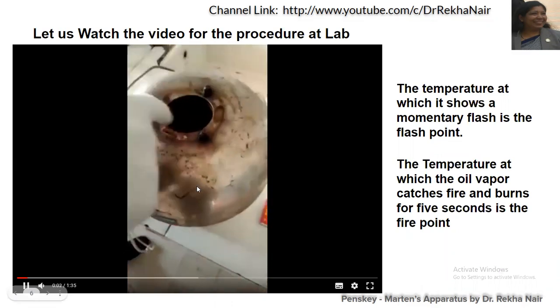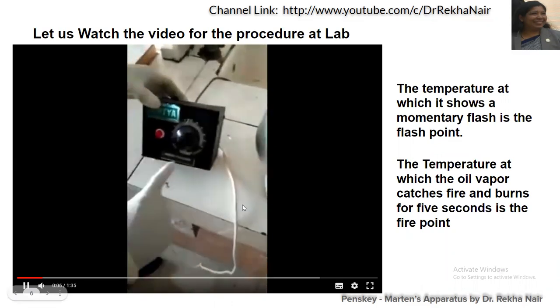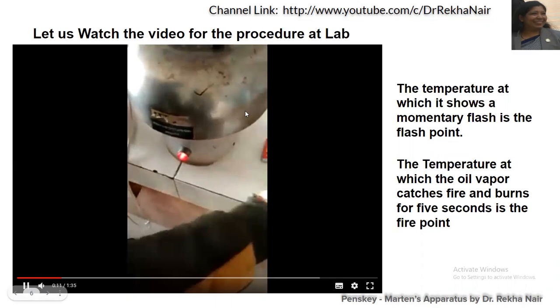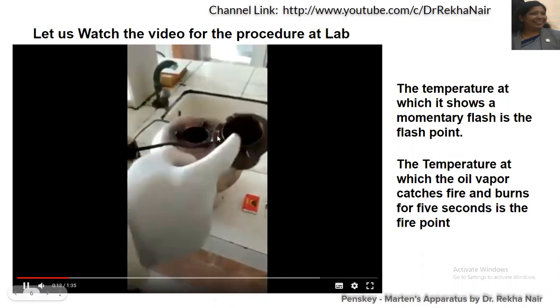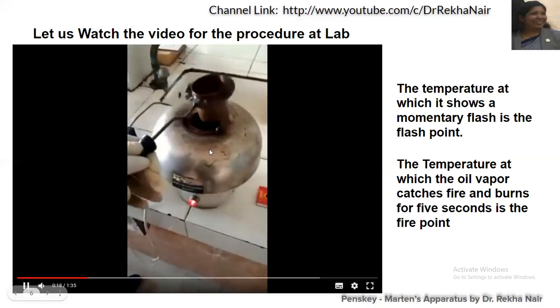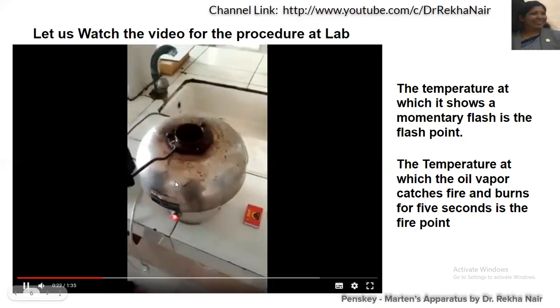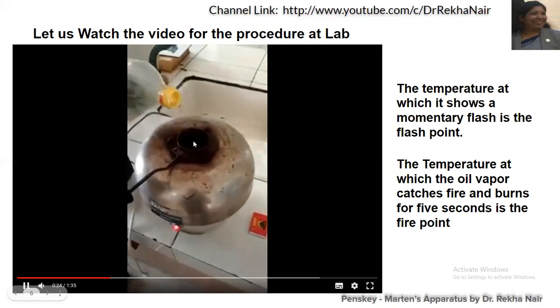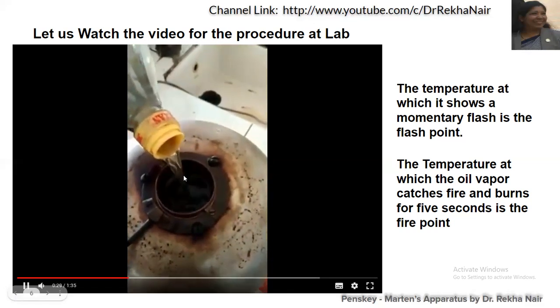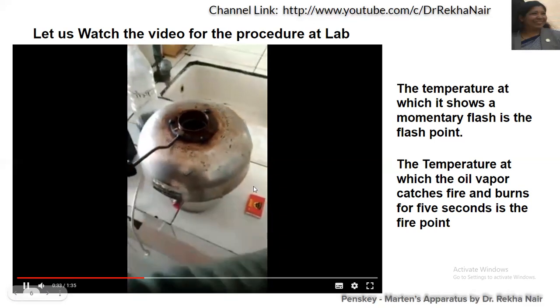This is a flash and firepoint apparatus. This is the place where we keep the oil cup. This is the heating device. This is the oil cup, and the oil cup will be filled with the oil sample up to the leveling mark. It is then kept in the air bath.